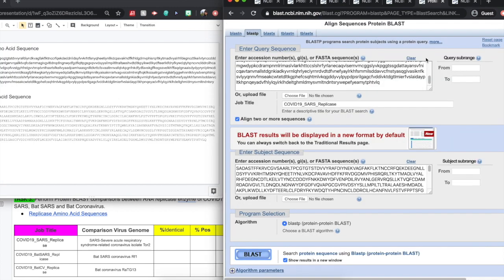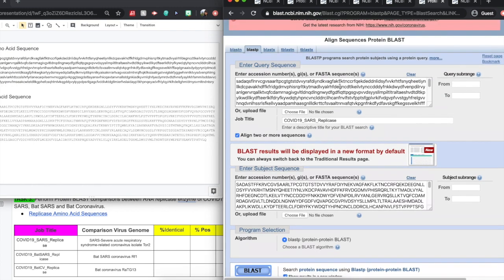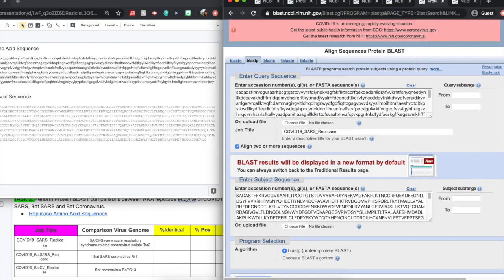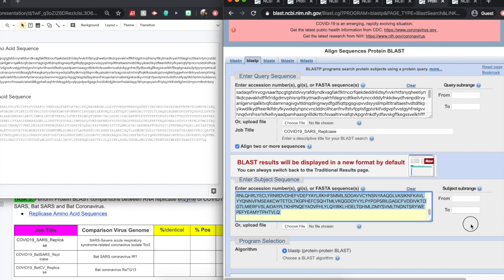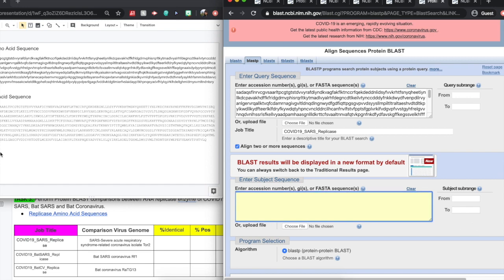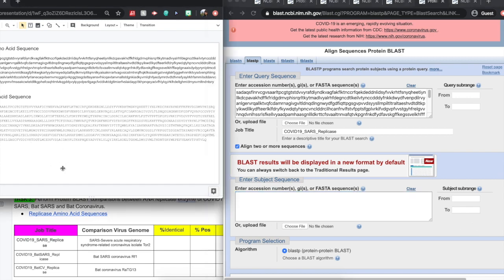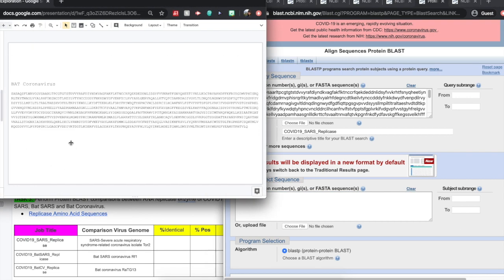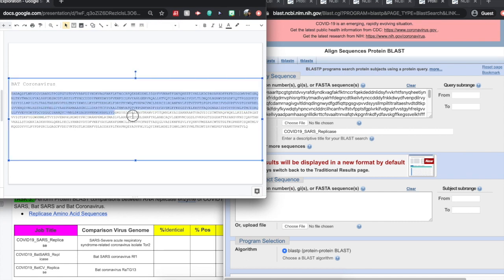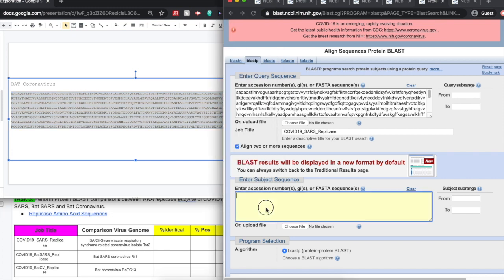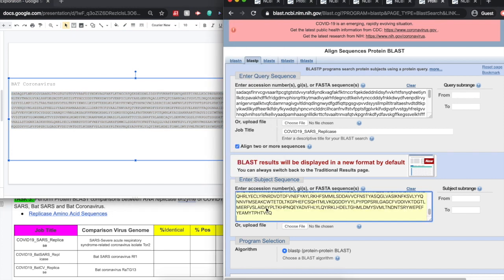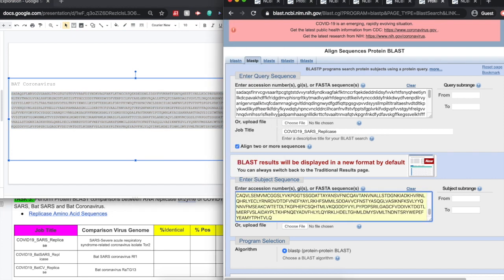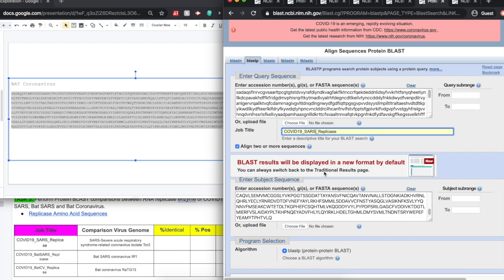So now going back to that original screen, we already have our COVID-19 RNA replicase amino acid sequence in the first box. So all we need to do is just simply copy and paste the second sequence. And we want to now work on the BAT-Coronavirus. So again, referring to that resource, we'll copy and paste that into the BLAST application.